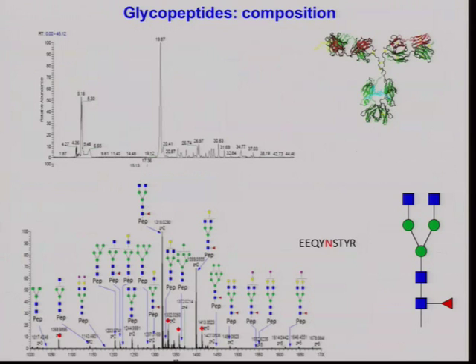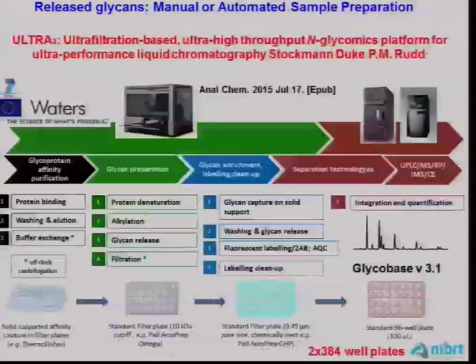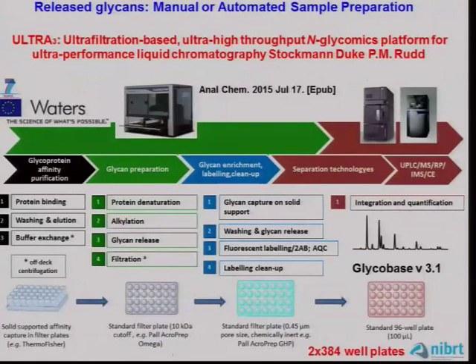Release the glycans, analyze those, look at your peptide fragments, and then ask the computer to look for this peptide piece with all of the sugars that you've identified from your previous analysis. So that's top down, that's what we'd all like to do. At the moment, those things are more or less possible depending on the molecule you're looking at and the strength of your analytical technologies.